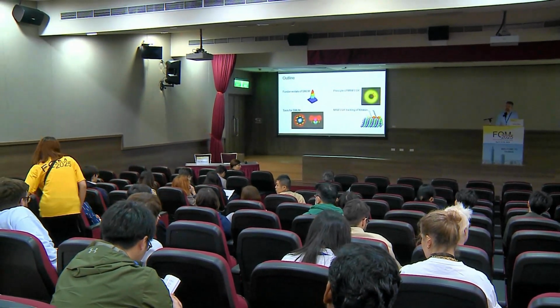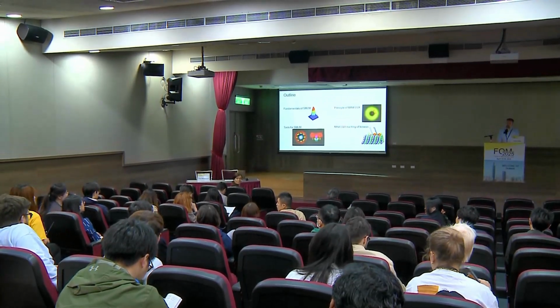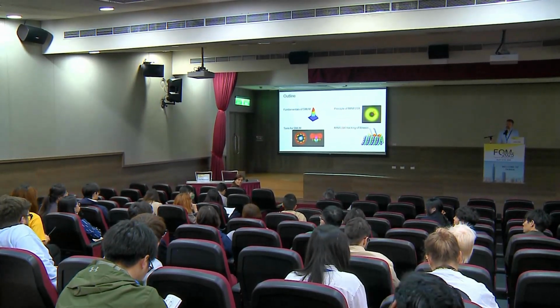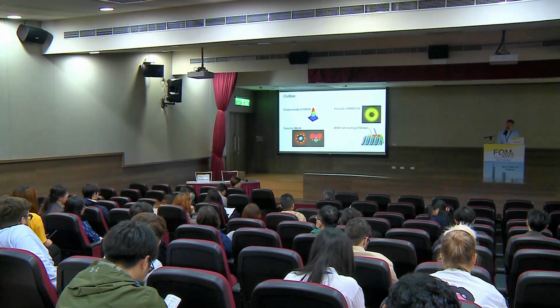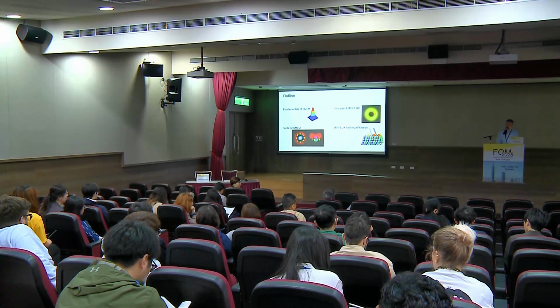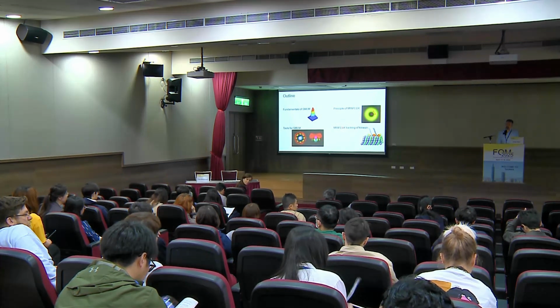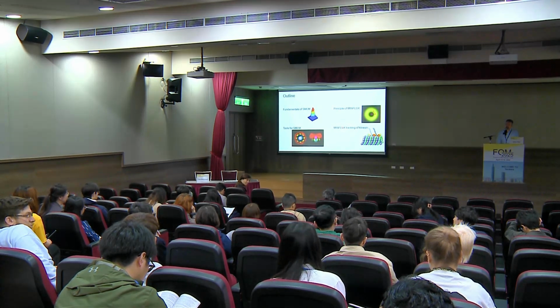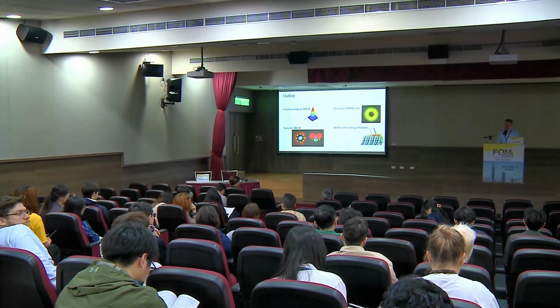Thank you for the great talk. We just set up our first SMLM machine in our lab, and we are using the commercial modality from Zeiss. So I would have a question about post-processing. We have the Zeiss software, and as you said, there are Picasso or SMAP. So which software would you recommend we use first?